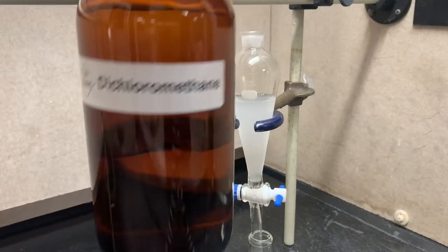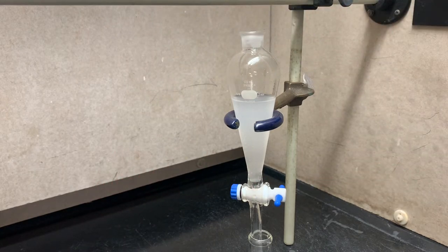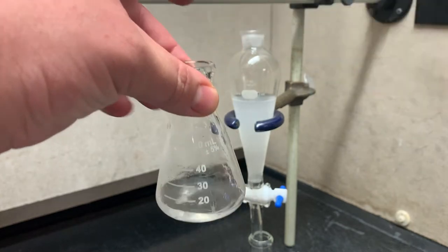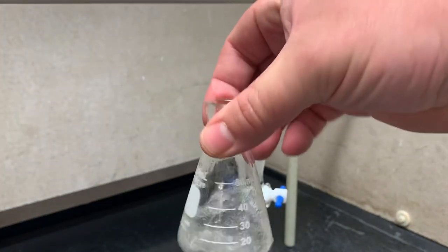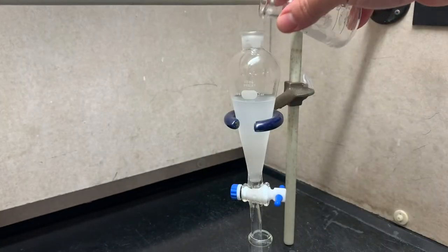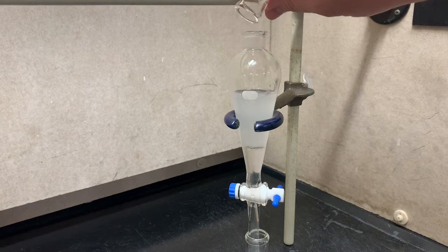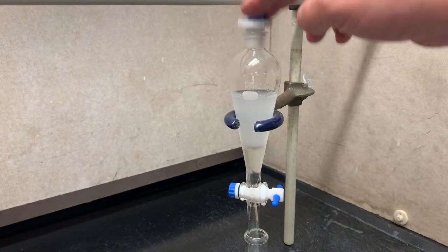Next, we are going to need some dichloromethane. We're going to do 5 mLs at a time. And we're going to start off by giving a quick rinse to our original flask here, make sure that we got everything that was in there. Add that in, cap that off.